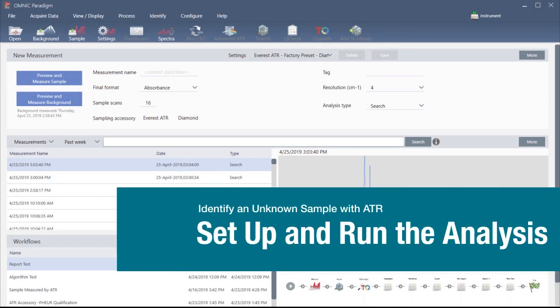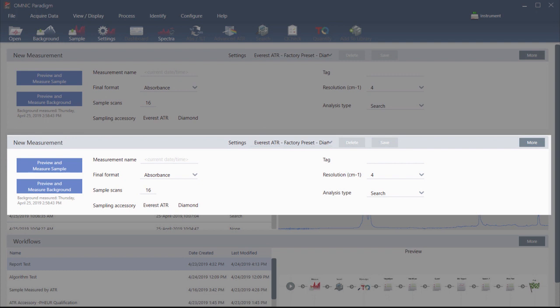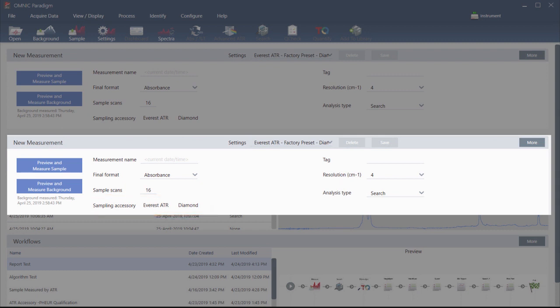Now let's move to the Omnic Paradigm software and look at the measurement settings. The important settings are right up front in the dashboard view. First, make sure this readout shows the installed accessory. If it doesn't, reseat the accessory. Then make sure the analysis type is set to Search. This performs a point-by-point comparison of the sample spectrum against FTIR library spectra.